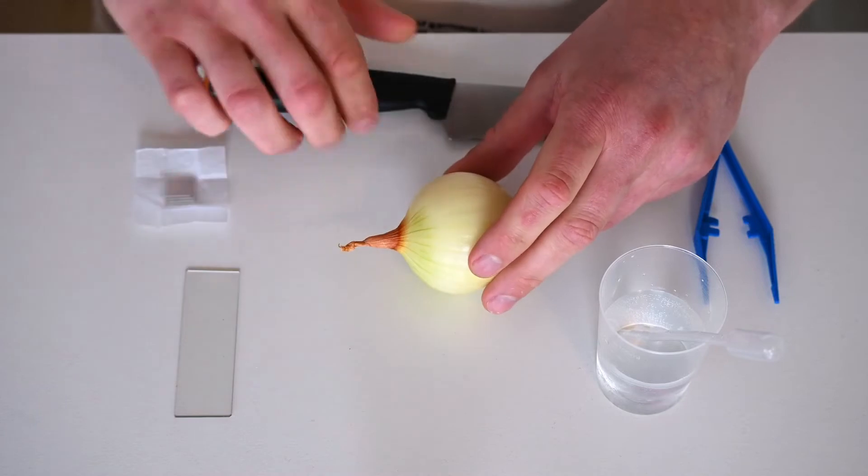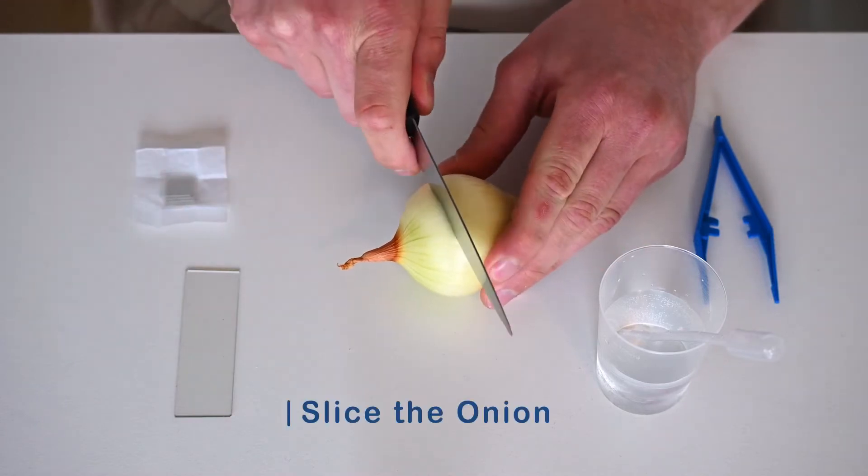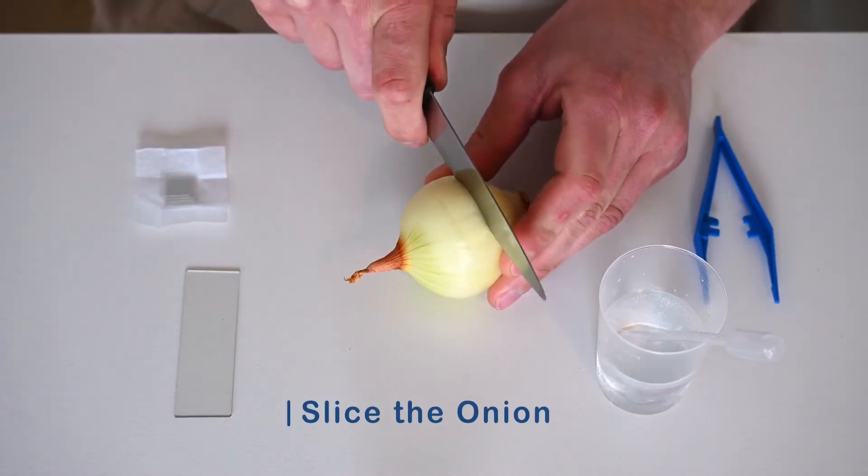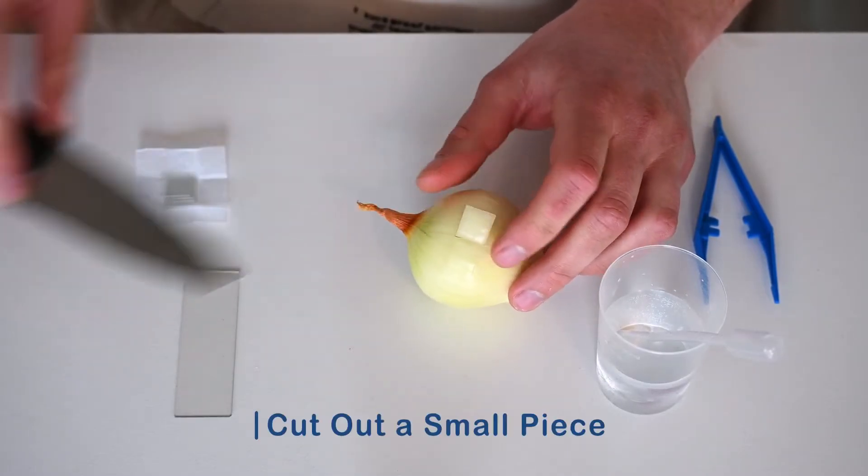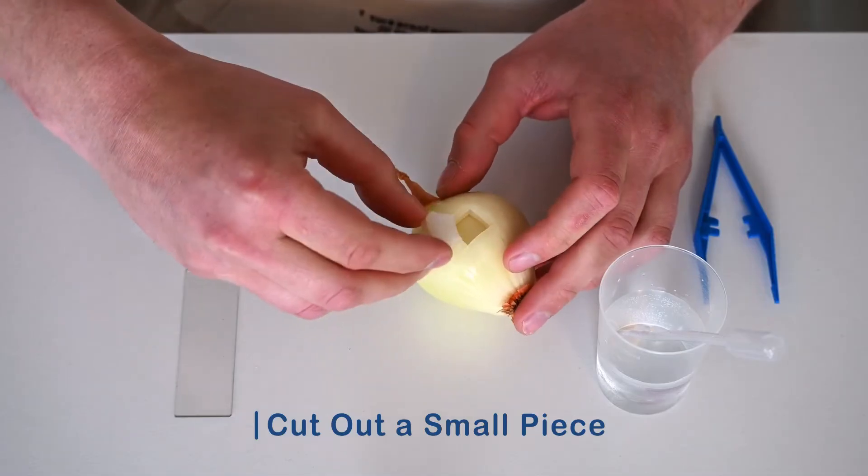The first step is to cut a small square in the onion, roughly the size of the coverslip. Between each layer of onion is another extremely thin layer, and that is what we want.